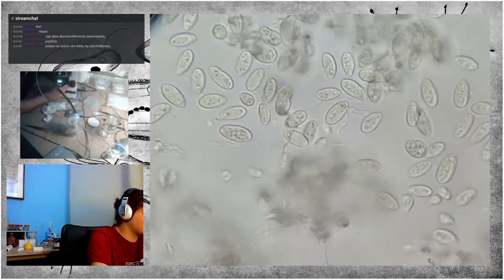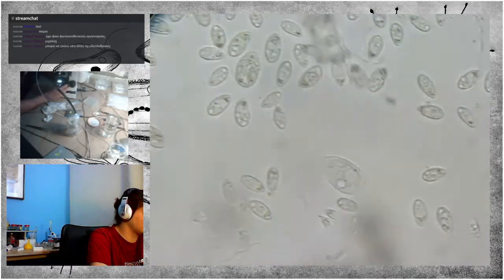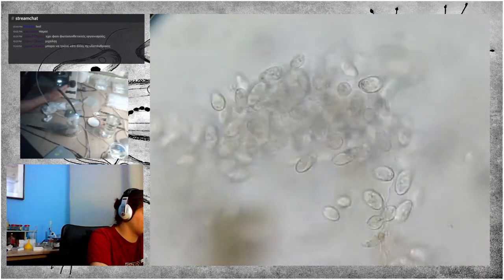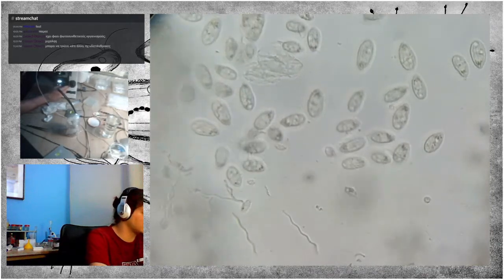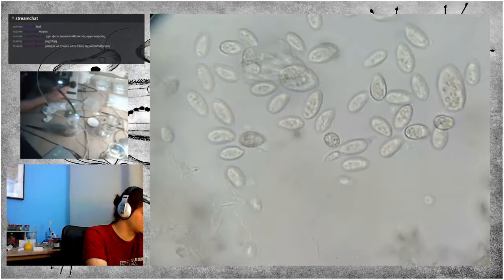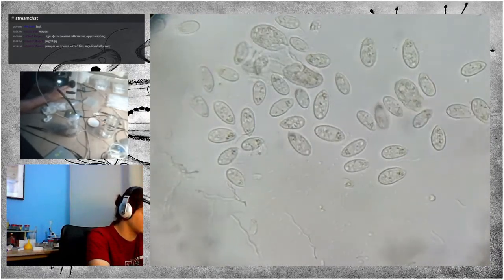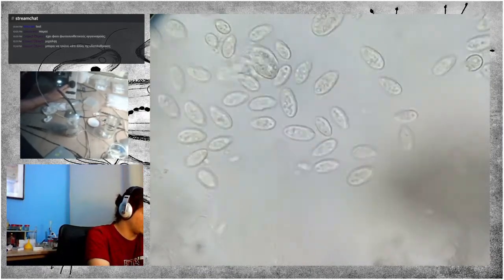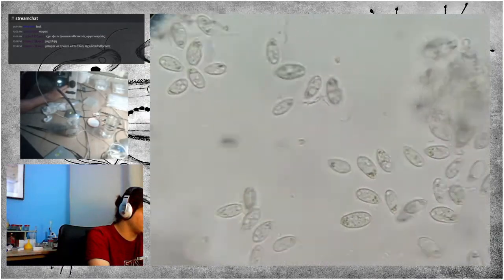Now, some ciliates look very similar and are very difficult to differentiate, if they have no morphological differences. So, for example, if there are two species of ciliates here, I mean the small ciliates that look very alike, we would need genetic data to identify any of them.